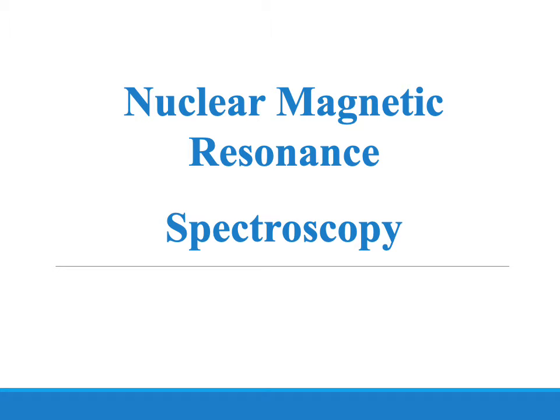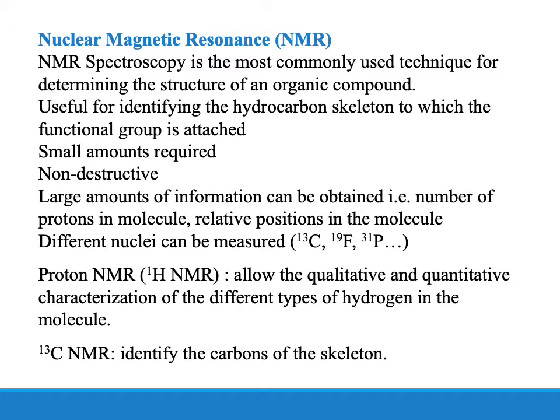Hello, everyone. For the last session, we are going to discuss nuclear magnetic resonance spectroscopy, NMR spectroscopy. NMR technique is very useful these days. Actually, it's a common technique these days.